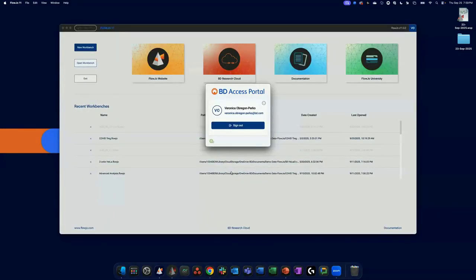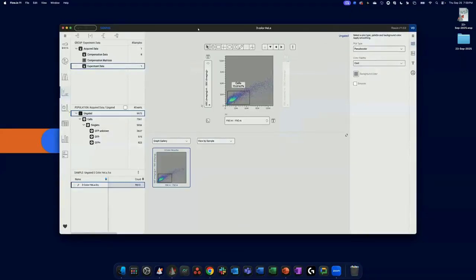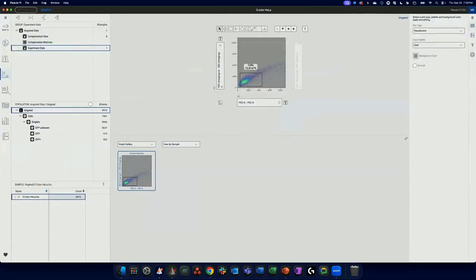Okay. And I'm just going to open up that same data set we've been looking at, but this time we're going to look at it in FlowJo 11. Okay. All right. So for those of you that haven't seen FlowJo 11, we have webinars that spend a whole hour on this topic.